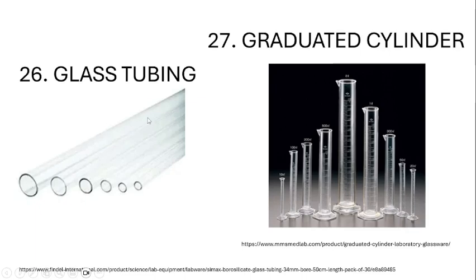So glass tubes are used as connectors. But there are still some other experiments which utilize glass tubes alone. And it comes in various diameters and it is made, of course, of glass.